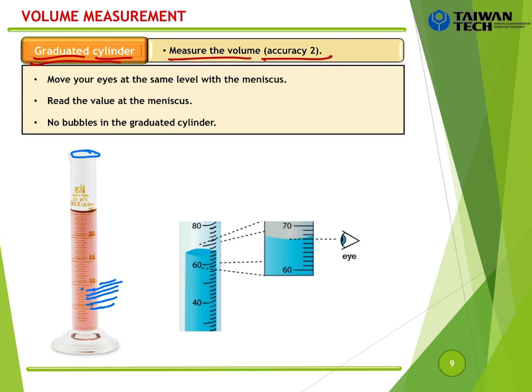And here we have one more in the middle. So it means that you can measure 5 or 5.5 or maybe 6 or maybe 6.5. So in the middle here you can also consider the value will be 5.75, right? Okay, in the middle as well.